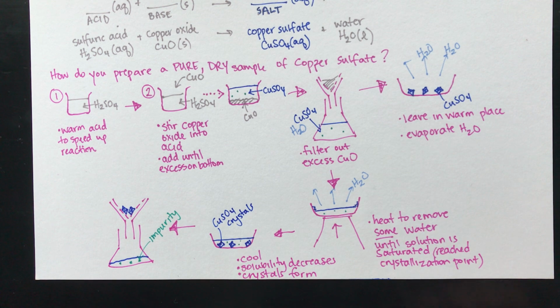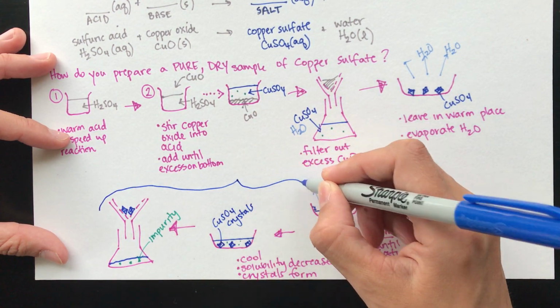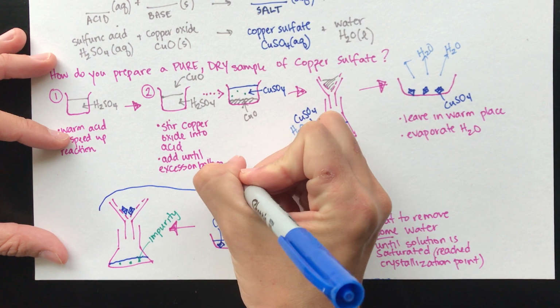Okay, so this one is a little bit more complicated than the first one we did because of this extra bit. Remember, this whole section here was called crystallization.